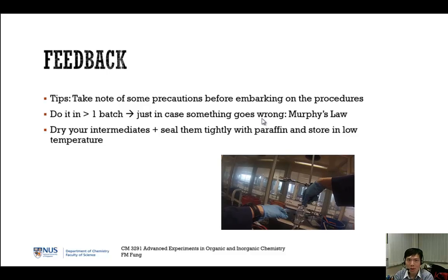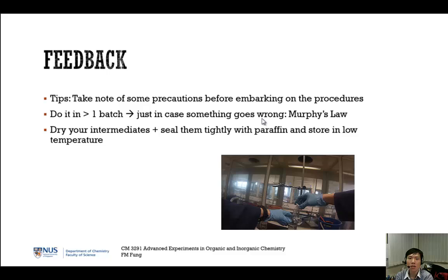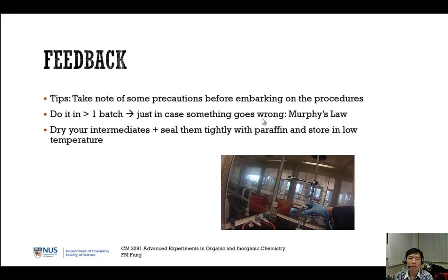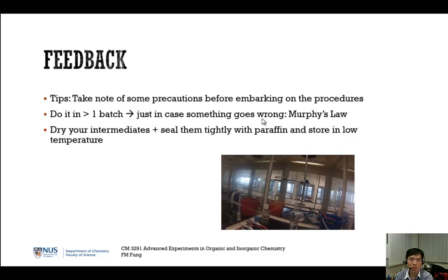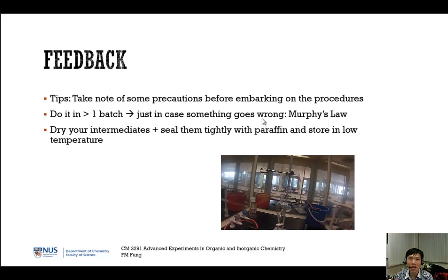Now, if you want to do it in one batch, be careful, because the experimental procedure is based on a certain amount given in the lab manual. You can't just say, I give you 5 times of that and everything multiplied by 5, without thinking that the capacity of the glassware is unable to cope with it. So you have to plan first and see whether you are able to do that when you scale up in that manner.